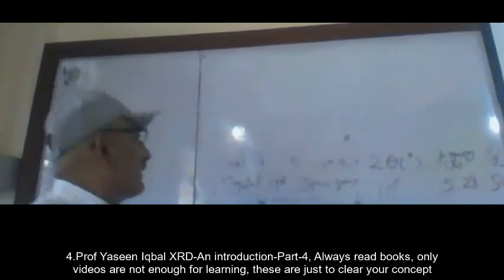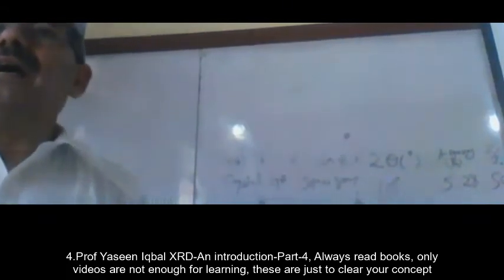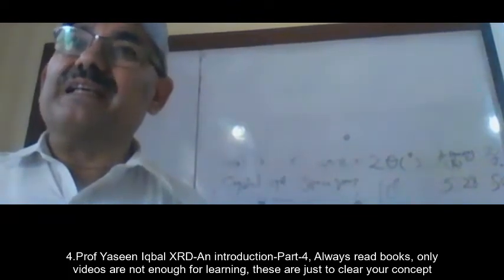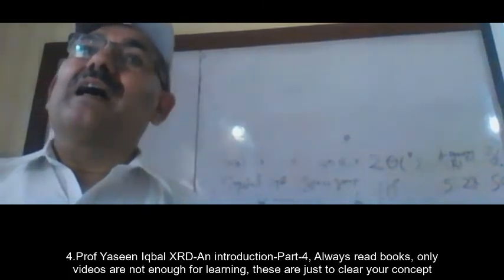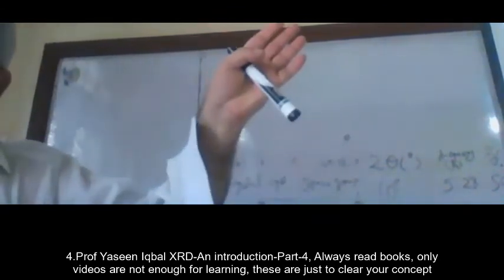As I told you, if this peak is 5.28, the next is 4.6, so when you go away from zero, the interplanar spacing decreases. These spacings are direct spacings, and reciprocal spacings are increasing when you go away from there, because you are dealing with the reciprocal crystal lattice.